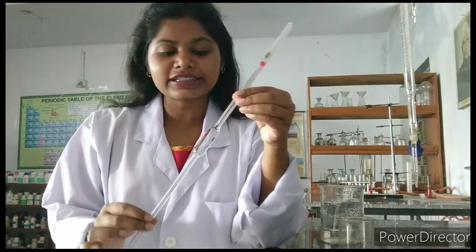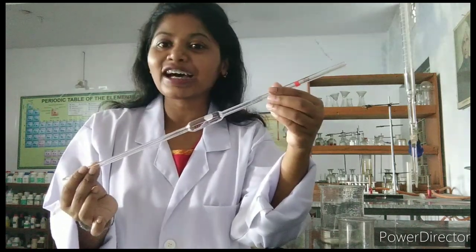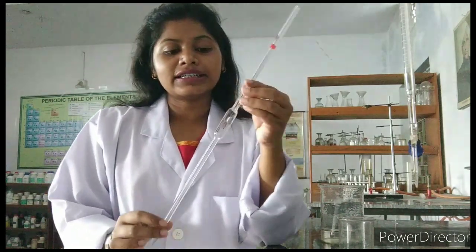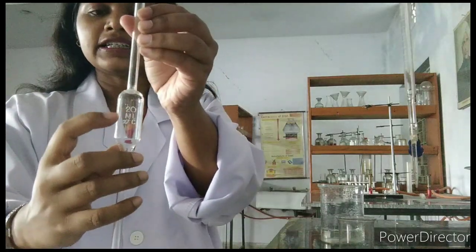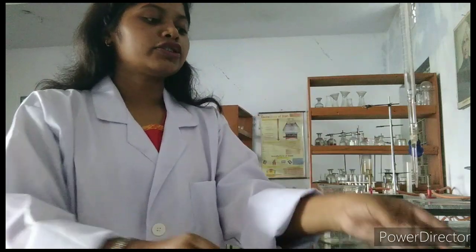Welcome back. Now I have a glass apparatus with me. We call it a pipette. This pipette I have is of 10 milliliter. Like this, I have one another — this is of 20 milliliter. The milliliter strength will be written on the glass apparatus. You can see that. So, what is the use of this pipette?